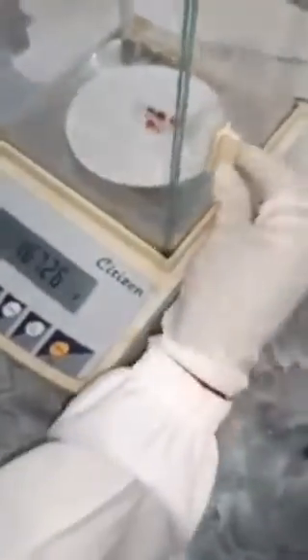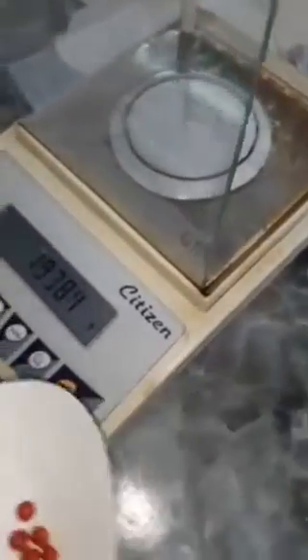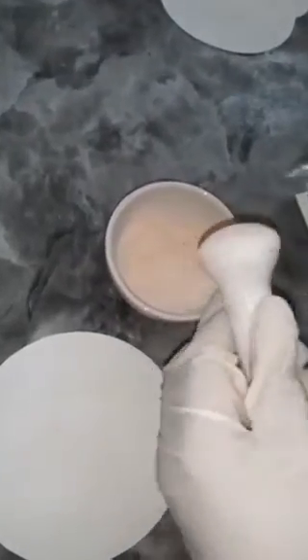From there, we're going to crush the tablets. We'll remove them from the balance and we'll crush them using a mortar and pestle. So make sure you crush to a fine powder. Now that the tablets are crushed, we're going to transfer the powder to a conical flask.